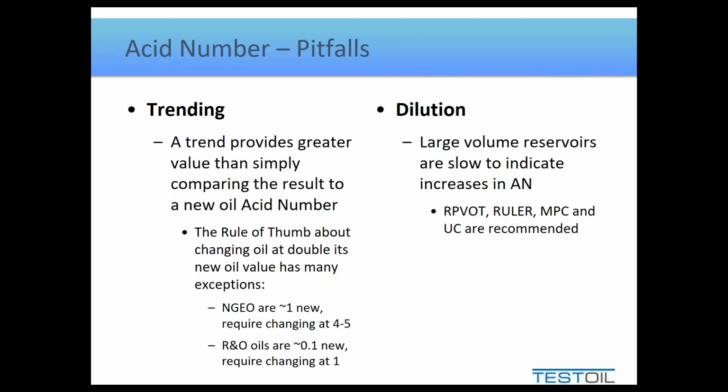If you read into the ASTM standards, they actually tell you how to come up with your own alarm limit for acid number and base number, and that is to simply do it empirically, meaning by experience. So pretty much what you do is you trend it over time. It should be a fairly linear line. The longer it's there, the more acid number will increase and the more base number will decrease. At some point, that rate will increase significantly, and generally you set the oil change to be just ahead of that.